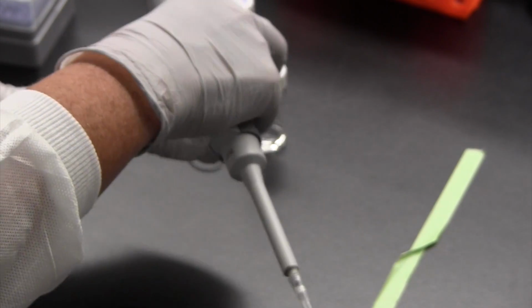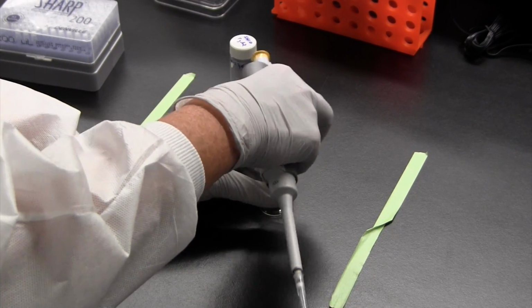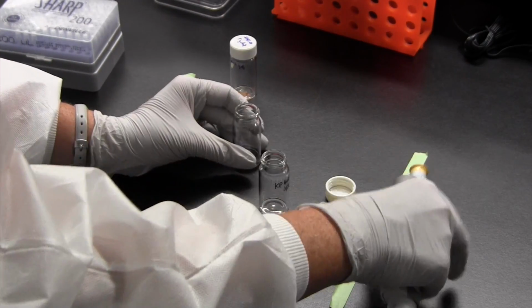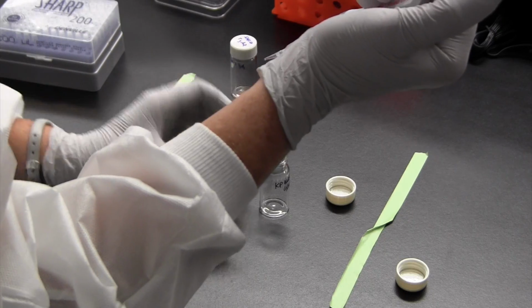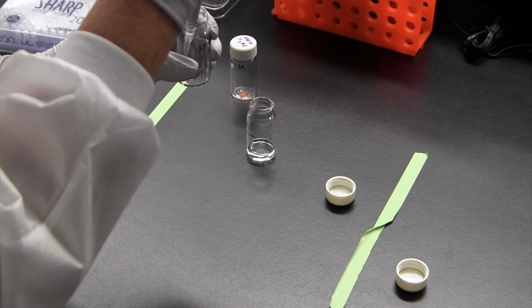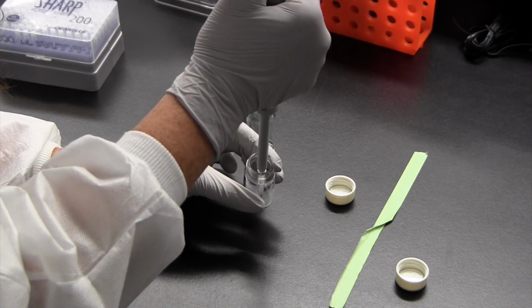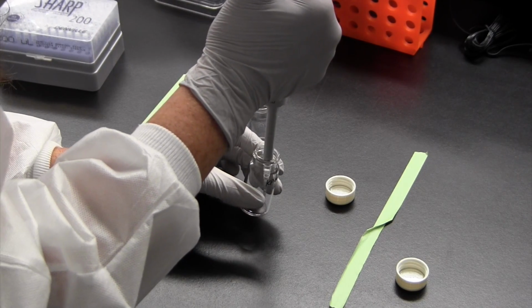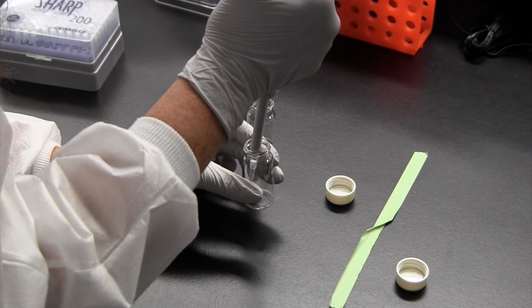So what you're going to do at this point is essentially take 100 microliters of ethyl acetate out of your small jar, and we're just going to use a pipette to resuspend our chemical extract in the scintillation vial. Keeping in mind that our ethyl acetate is going to evaporate pretty quickly, you don't want the students to use a ton of time here. So I'm just gently pulling up the ethyl acetate and resuspending it by moving it around the scintillation vial.